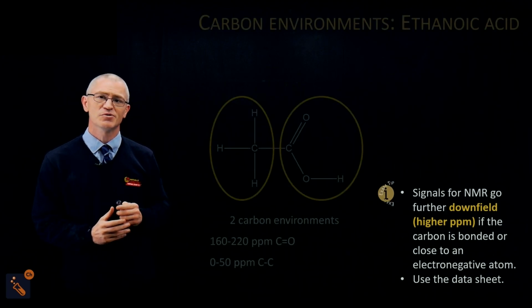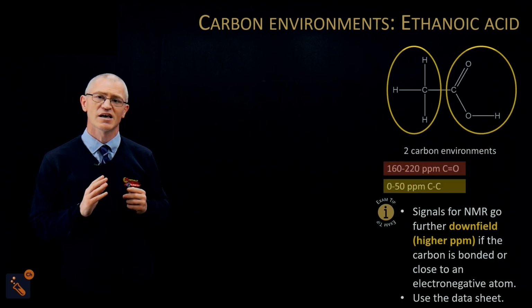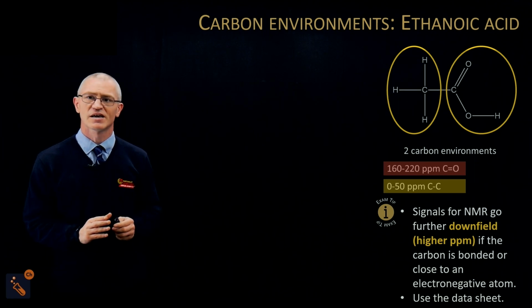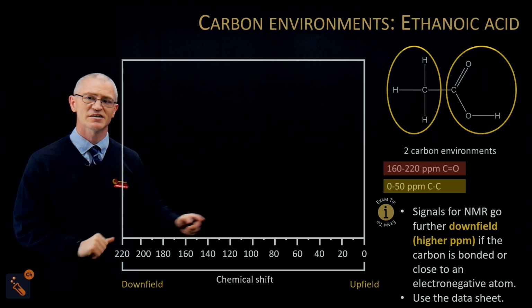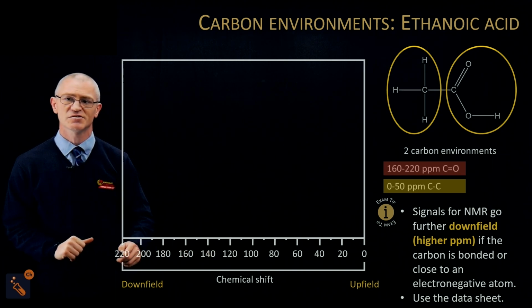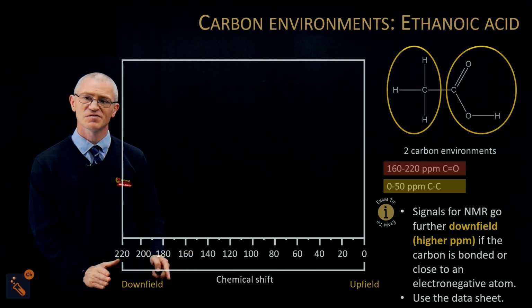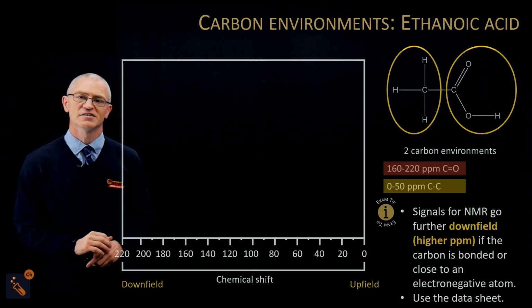So, if we put that up into the corner, and then we highlight them in red and orange. Now, let's put our carbon-13 NMR in front of us. So we've got carbon-13 NMR, and as I said, it goes from right to left, so 0 to 220 is your range, and that's your chemical shift. Downfield is towards the left end, and upfield is towards the right end.